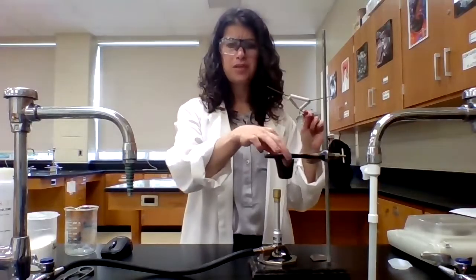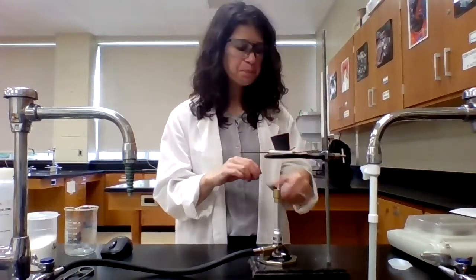So the setup that I have here: I have my ring stand, my Bunsen burner, an iron ring, and a clay triangle. Now the point of the clay triangle is just to make sure that the crucible doesn't fall through. Notice that I'm heating my crucible without the lid because we want the water to evaporate and escape. I don't want to trap the water inside.